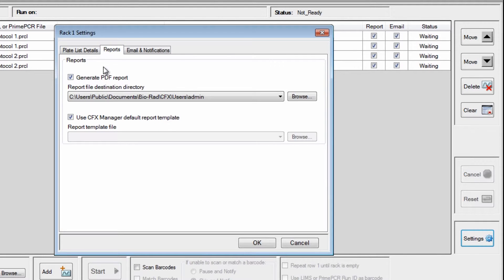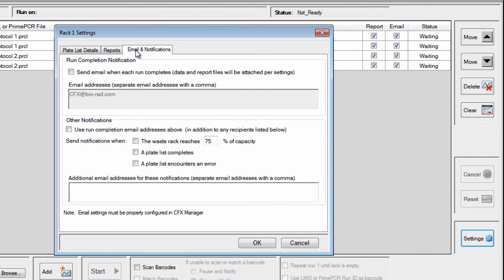If you would like to receive email notifications, click on the Email and Notifications tab. Check the Send Email When Each Run Completes box and enter your email address. Then click OK.